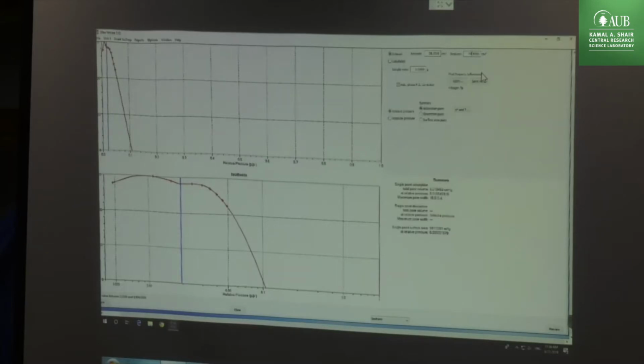So they came to us at Micromeritics and said, we cannot buy pure gas, and you're telling us it's a free space. How do you know it's a free space? If it's the free space, and I correct the free space, I should get a good adsorption isotherm. If it's a problem with the instrument, you cannot fix it. Anything you do, it's going to go down like this, because you cannot change the volume adsorbed. You can only change the free space. So how do I know if it's really free space or an instrumentation problem?